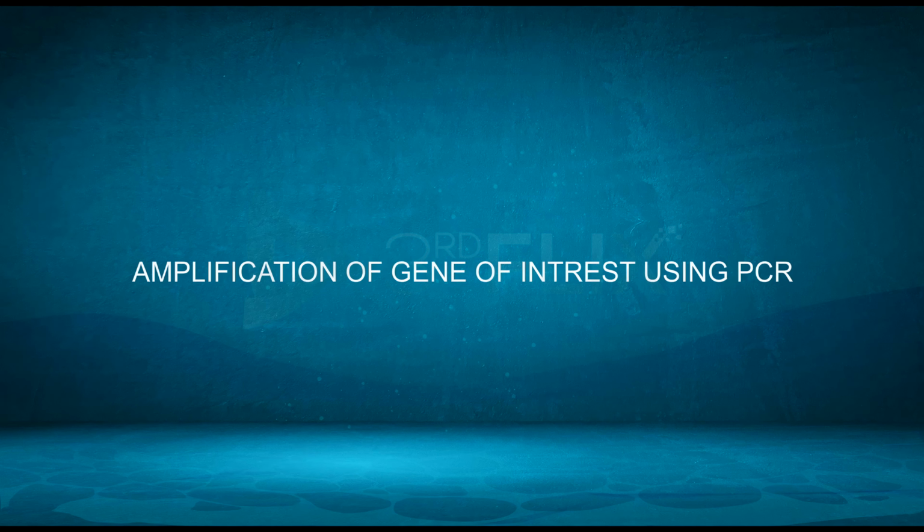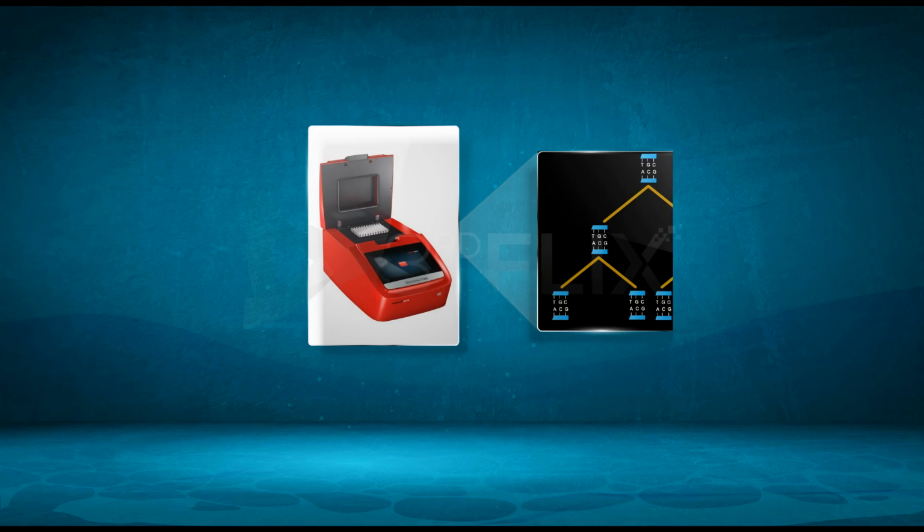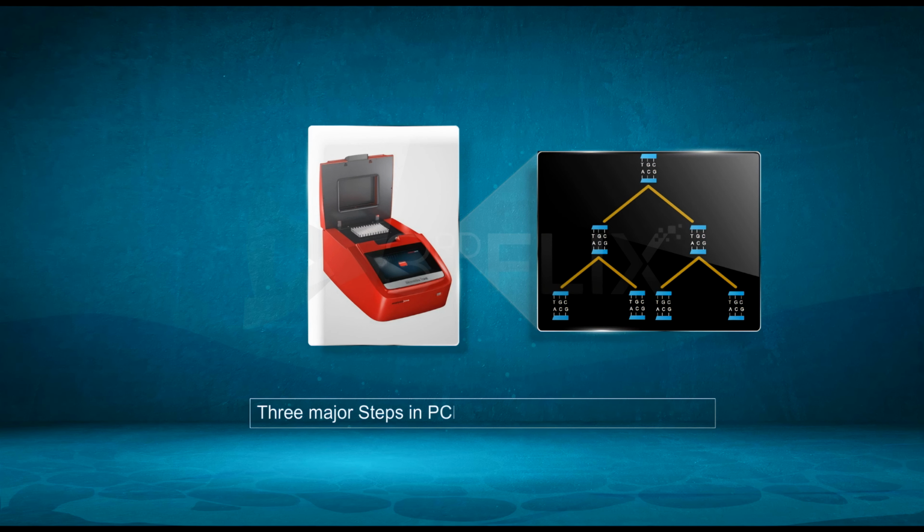Amplification of gene of interest using PCR. Polymerase chain reaction helps in multiplying the genes in more number. 3 major steps in PCR are repeated for 30 to 40 cycles. The instrument used for conducting PCR is called automated thermocycler.